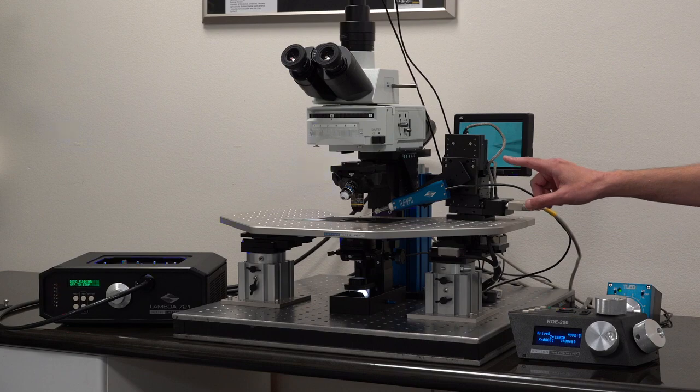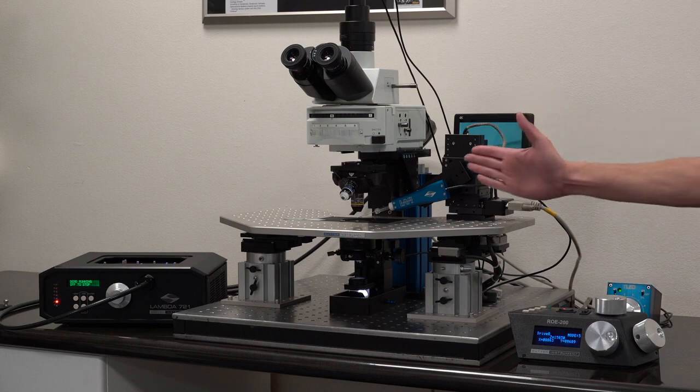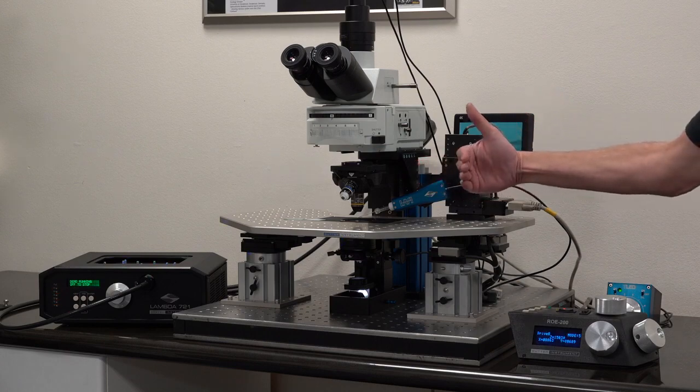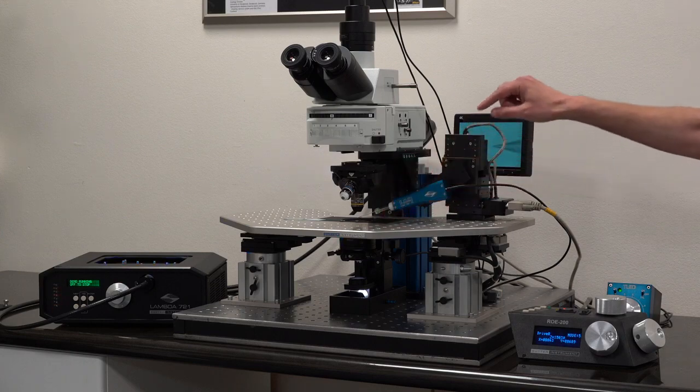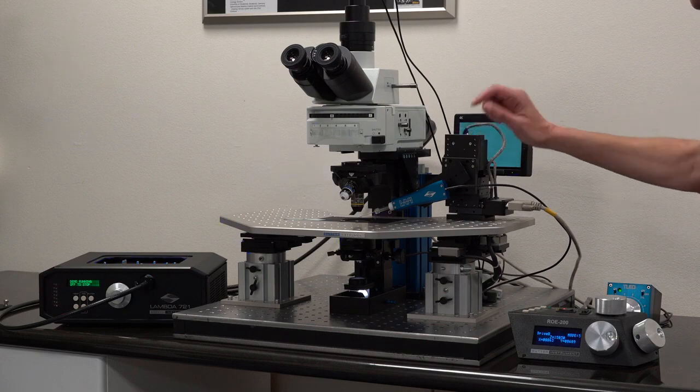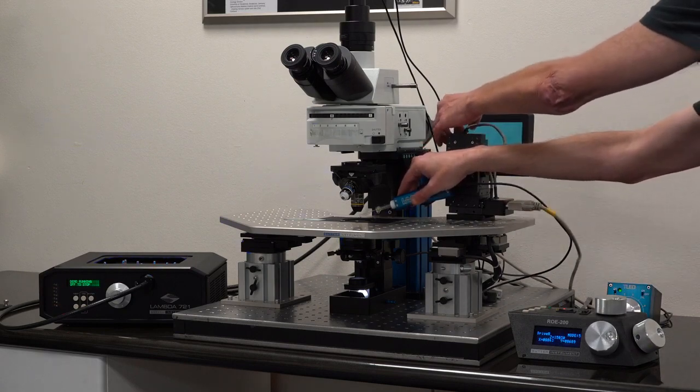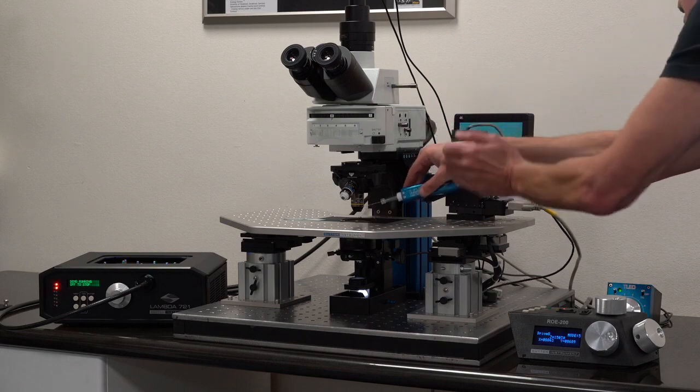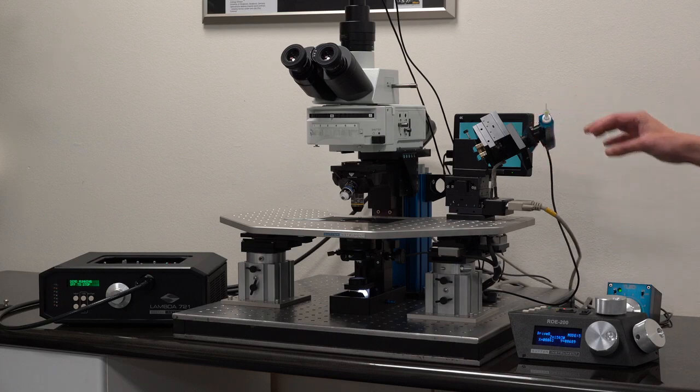One major feature in this new manipulator is the door. So my traditional doors open up 90 degrees. And sometimes that is difficult to change pipettes over here. But look at this one. I unscrew the door and the manipulator comes up and away, making it easy to change pipettes.